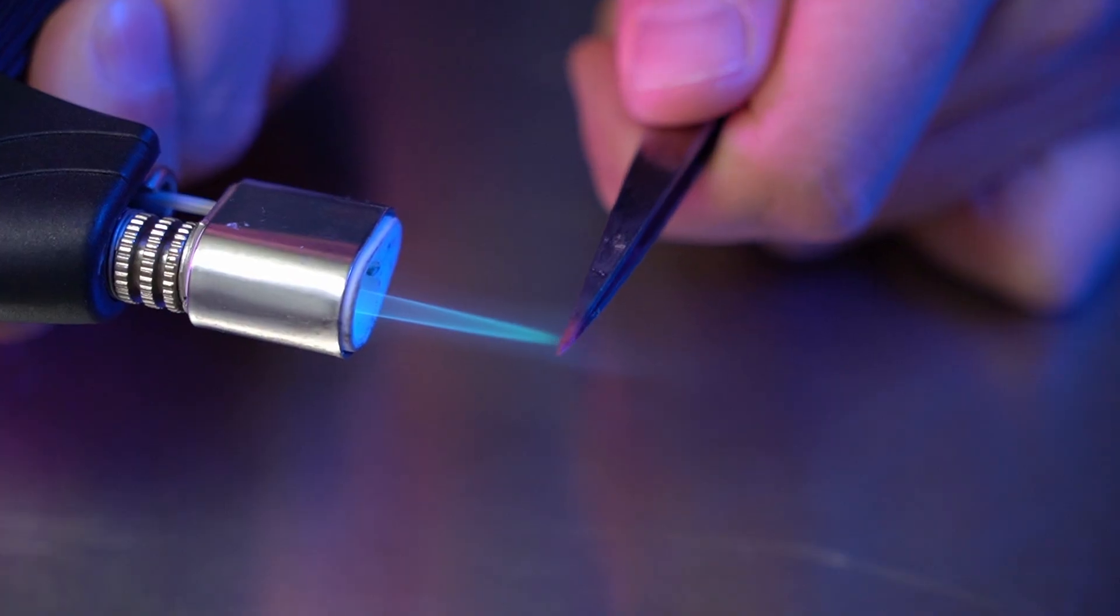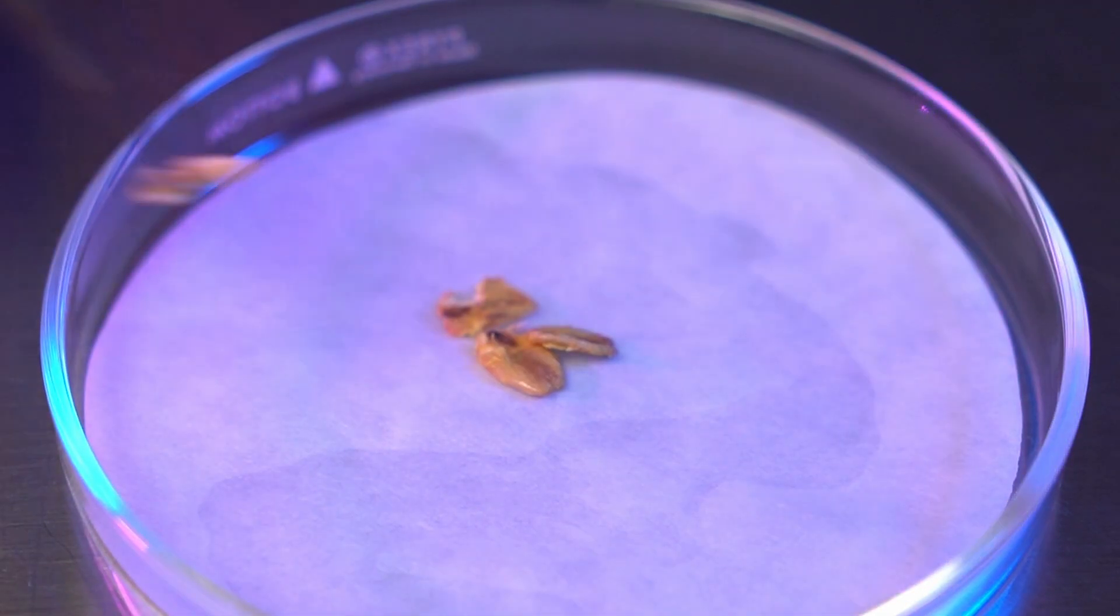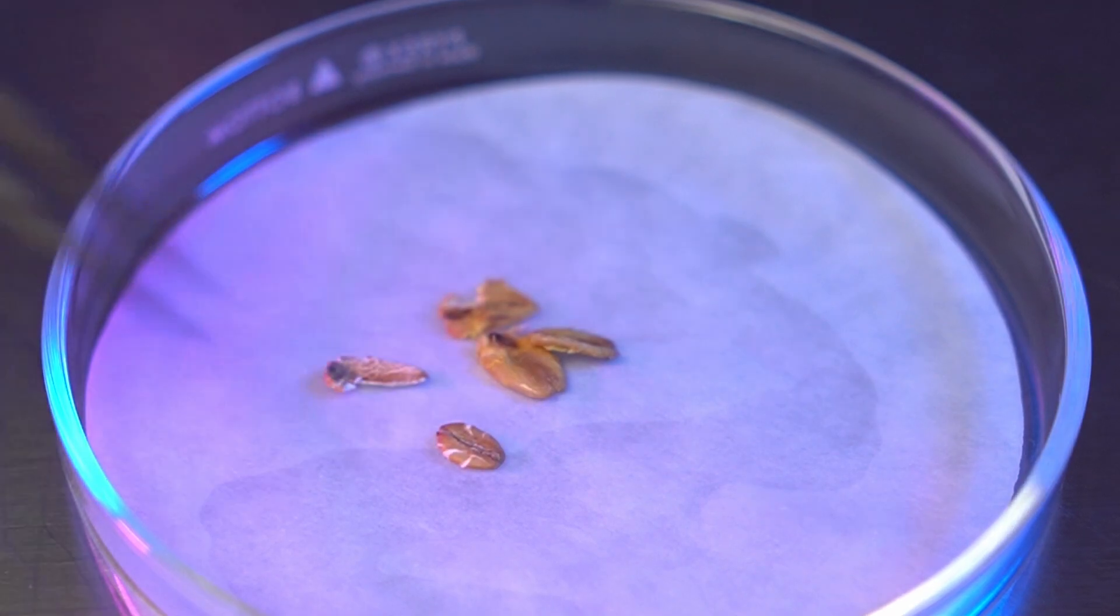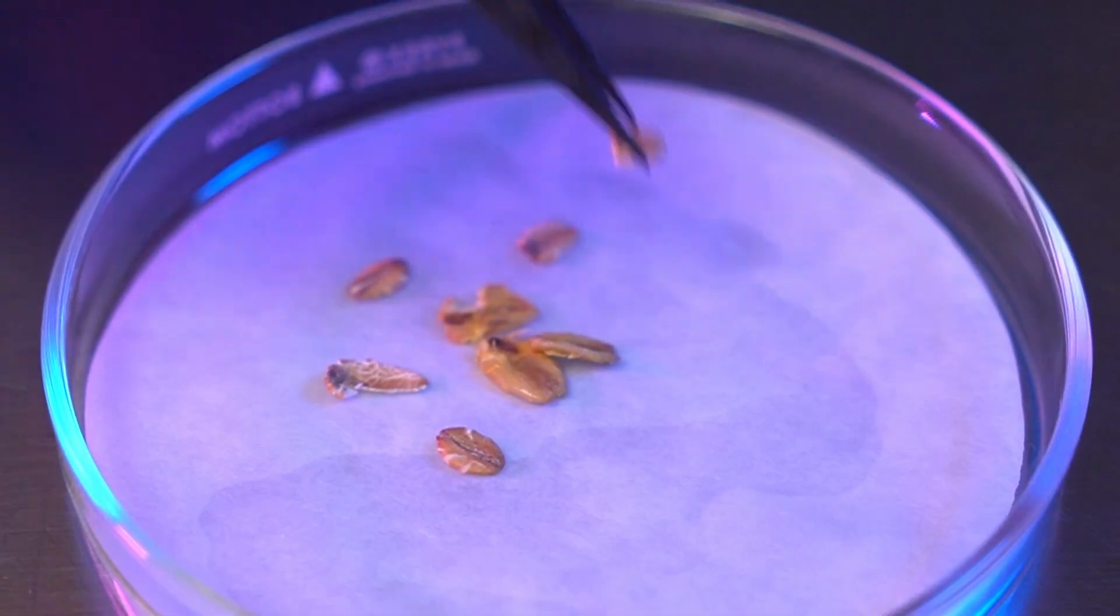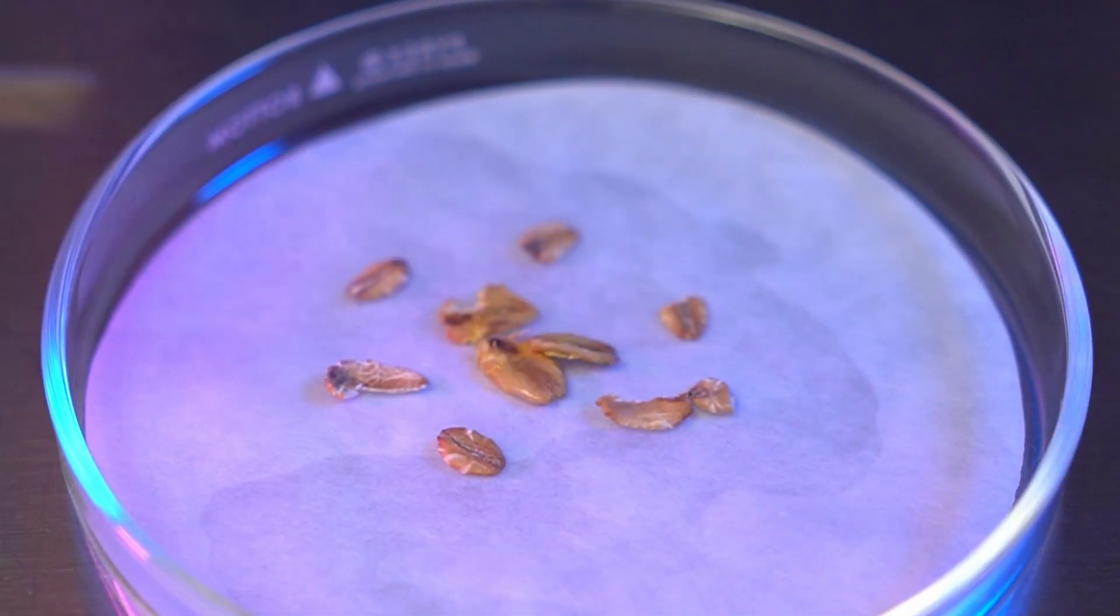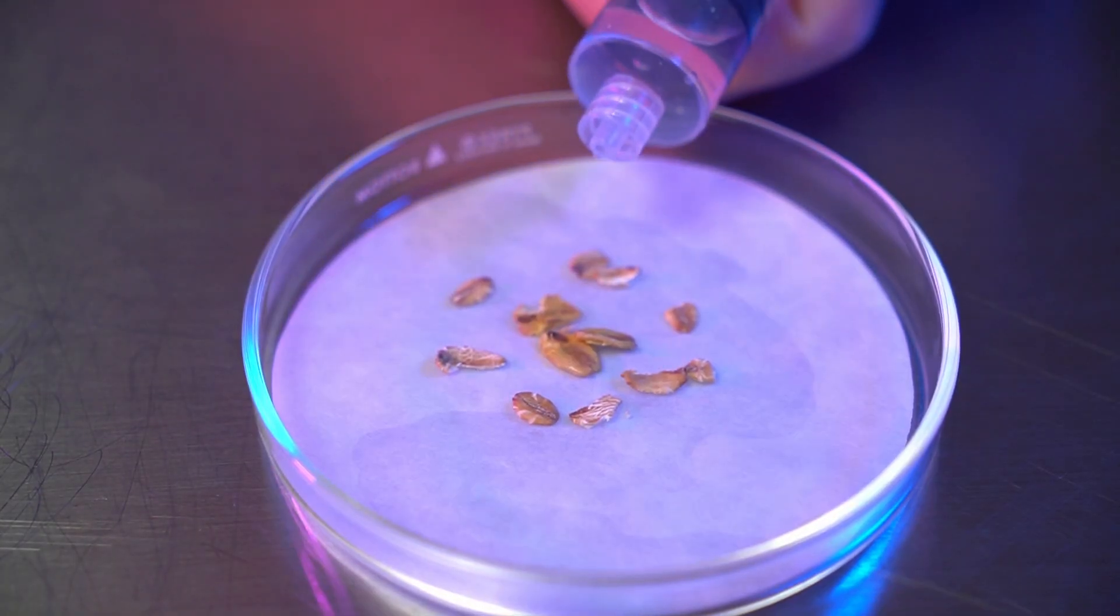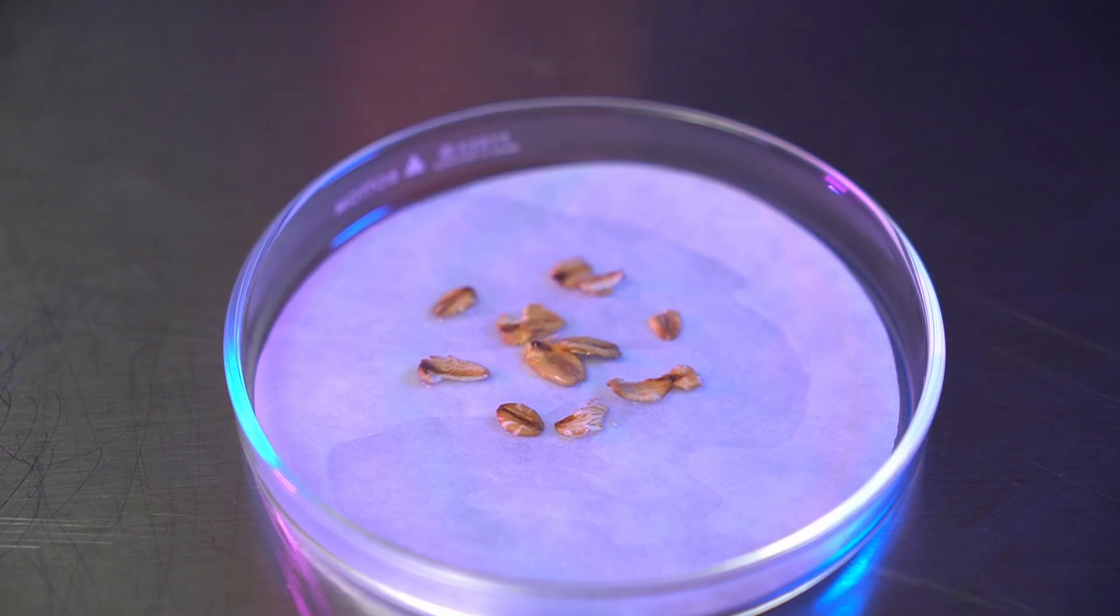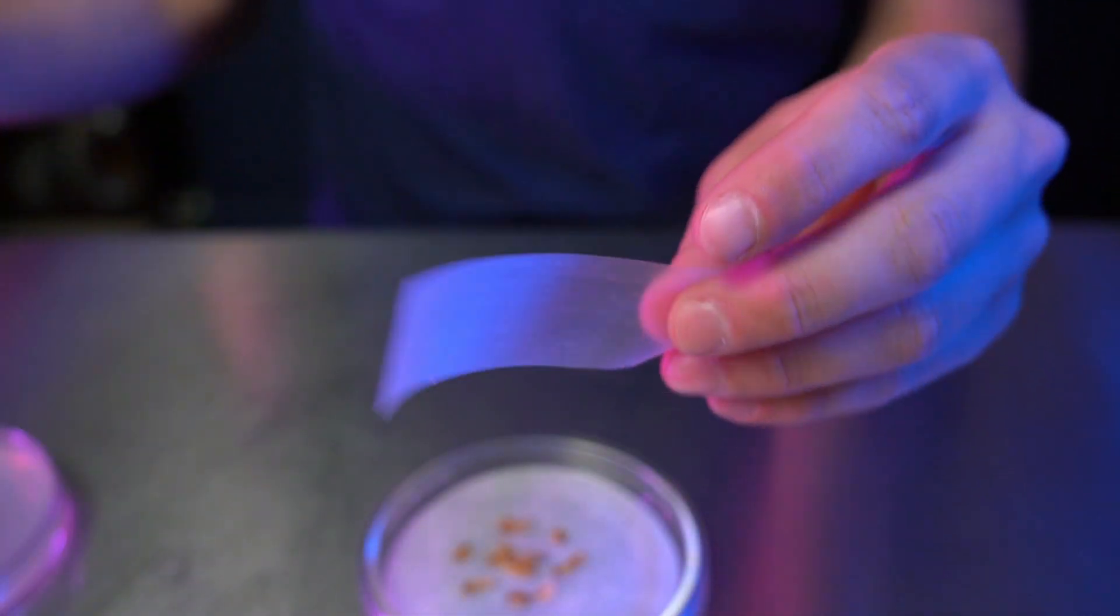After wiping and sterilizing our tweezers again, we can transfer some fresh food onto the plate as well and hydrate it with our syringe. Wrap the plate as mentioned before.